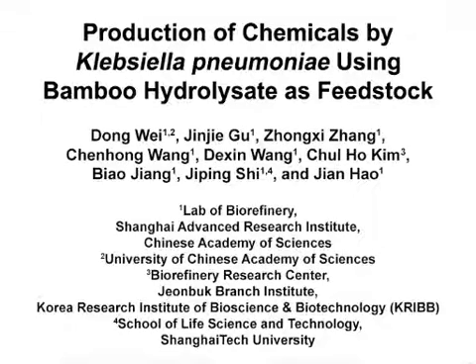The overall goal of this experiment is to observe production of the chemicals 2,3-butanediol, R-acetoin, 2-ketogluconic acid, and xylonic acid by Klebsiella pneumoniae using the hydrolysate of bamboo as the feedstock.